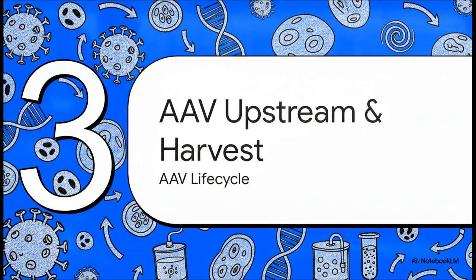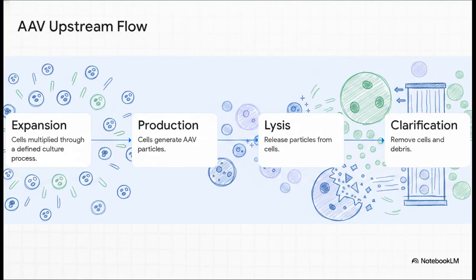So the crucial point here is that the platform you choose fundamentally dictates your entire process. And we're going to look specifically at the life cycle of adeno-associated virus, or AAV. Here is the high-level upstream flow for AAV. Step 1, cell expansion. The starting cells are really carefully multiplied through a very defined culture process. Step 2, production culture. This is where the magic happens, and the cells actually generate the AAV particles. Step 3, cell lysis. We'll get to exactly what that means in a second, but basically, it's about breaking things open. And finally, step 4, clarification, where we clean up the mixture to collect our vector.